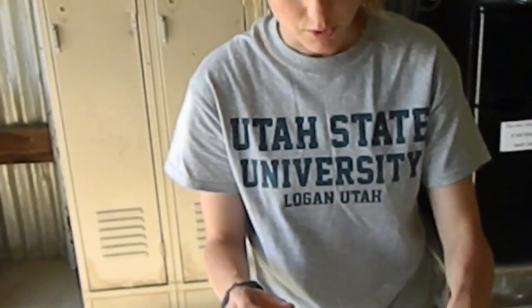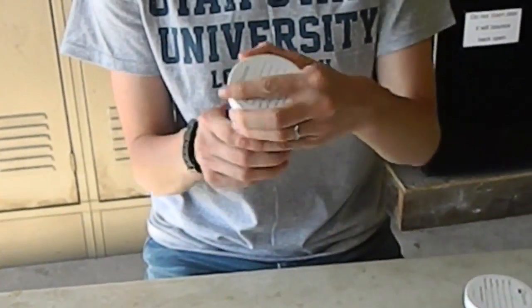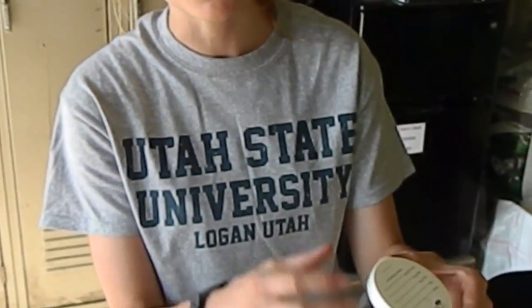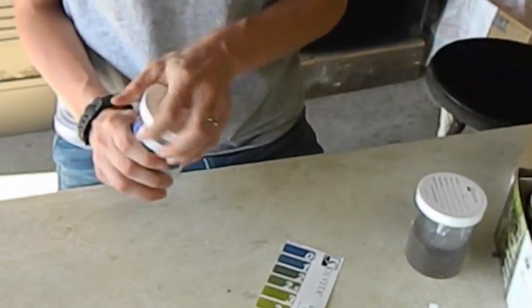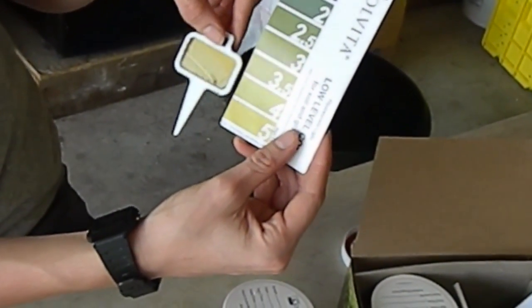Then you open one of these, put a paddle inside, and close it. Make sure you close it pretty tight, because it needs to measure the CO2 just within this container, not from outside. Let it sit for 24 hours at room temperature — don't leave it outside. After 24 hours, open it and compare the paddle to the Solvita color chart to determine your result.